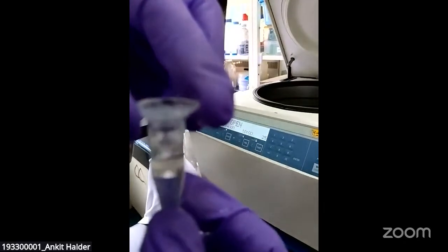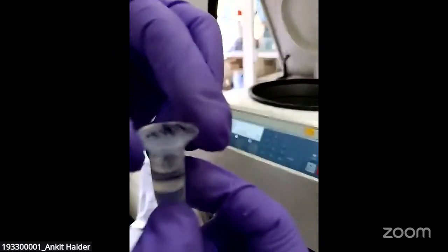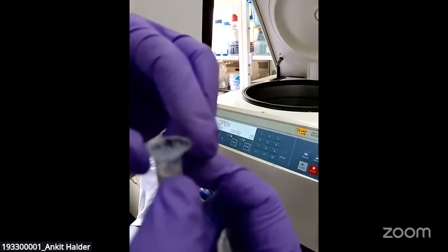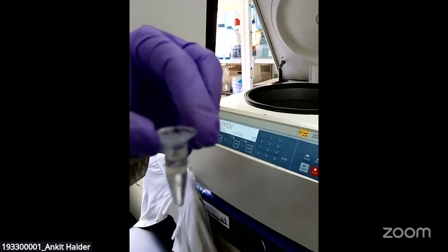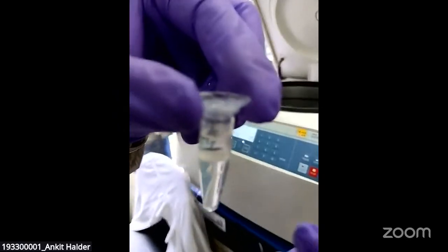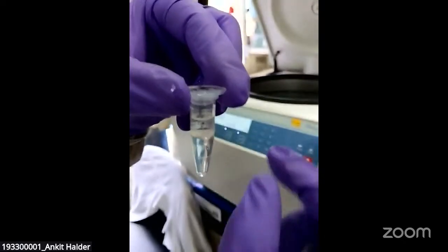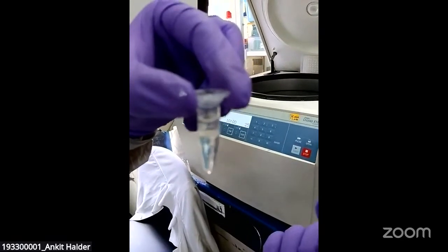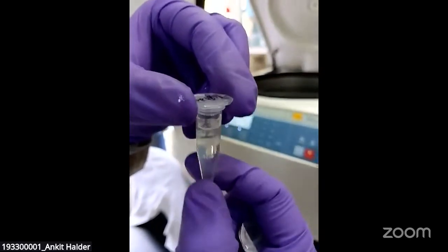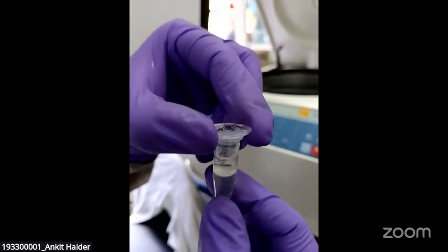In the lower part, there will be lipid molecules. They are dissolved in the chloroform. In the middle part, there will be proteins, and in the upper part, there are the polar metabolites, which are dissolved in the methanol. Now, suppose from one sample you are trying to do metabolomics and lipidomics. If you take the upper layer, you will go for drying and you will get the metabolites there. And if you dry the lower part, you will get the lipids from the sample.